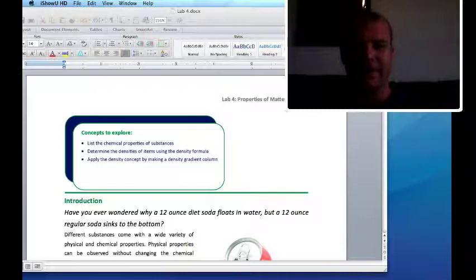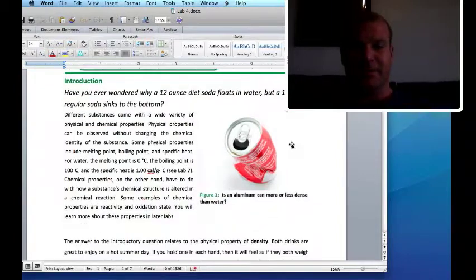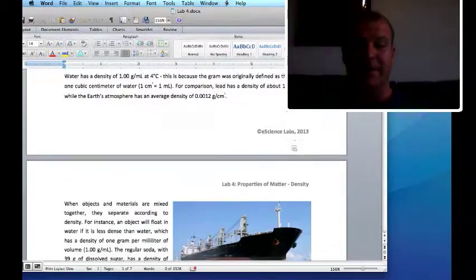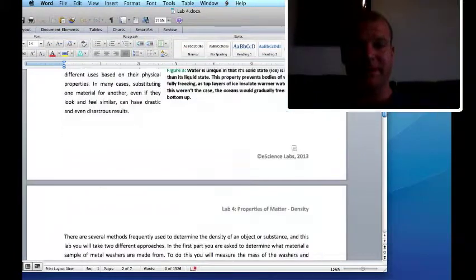So this is our lab number 4 prelab, and we're going to use methods to determine density. We already did a lab on density, but we're going to use a little bit more experimental technique for these.